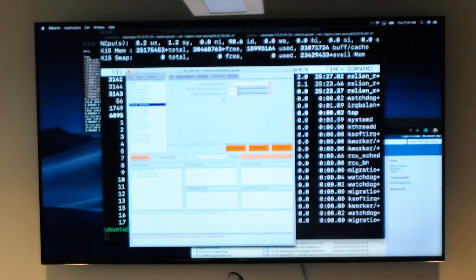Basically, if here's my particle and I picked here and I picked here, well, I'm actually double picking the particle. You just want to pick that particle once. And so the defaults are pretty good, where in case I did any double picking or I just picked too close, where I might pick a particle but it might align to the neighboring particle because I centered it so poorly, or it just was never centered in the first place, you can do that.